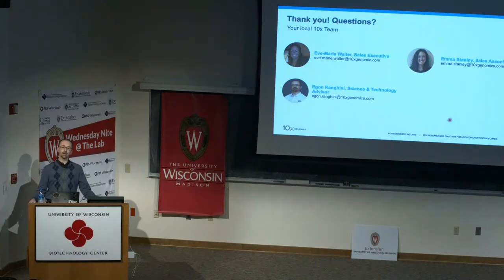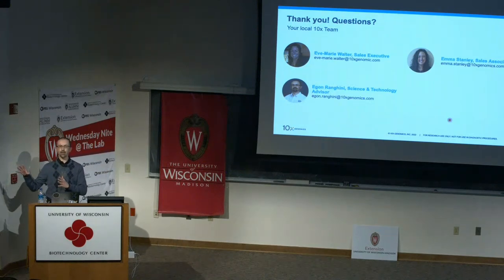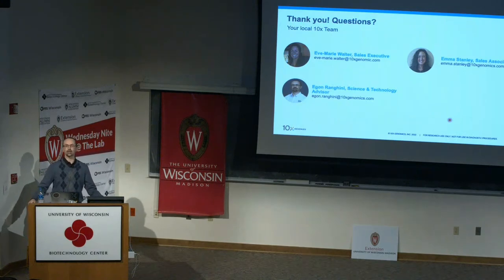In the meantime, if there is interest in that, let me know. I'll pass this information to our team. And there is also a paper in which the authors spiked in custom probes on Visium for FFPE, so it's not exactly single cell Flex, but the method is similar. It's similar enough that we can think about perhaps using that paper as a starting point and then using the tech note as soon as that becomes available.